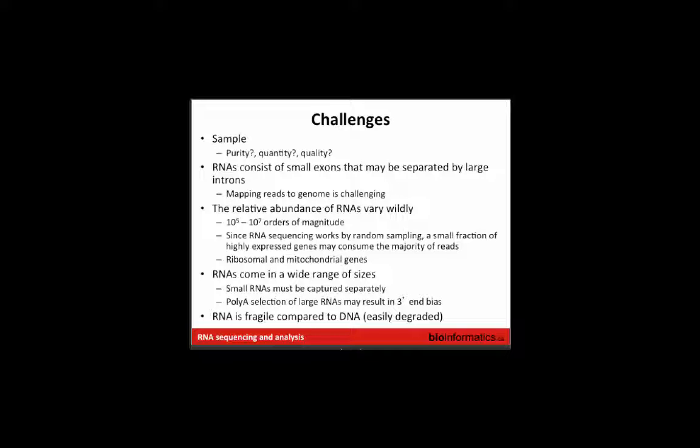Where do you place, for instance, extended procedures, cDNA subtraction, for example? If you don't need quantification, you can get to rare constructs easily by subtracting.